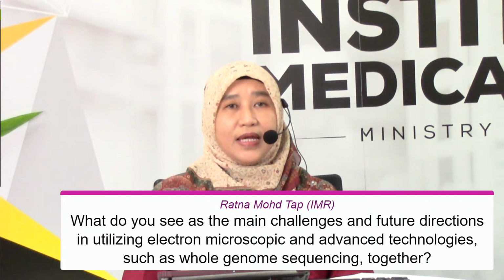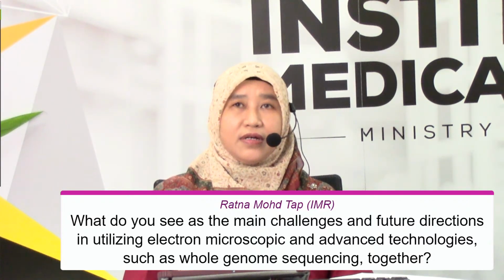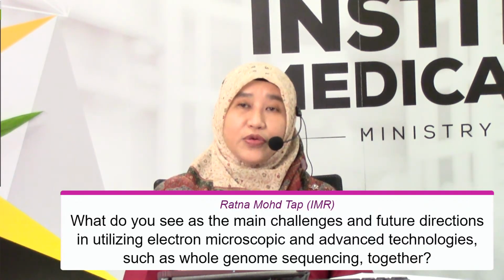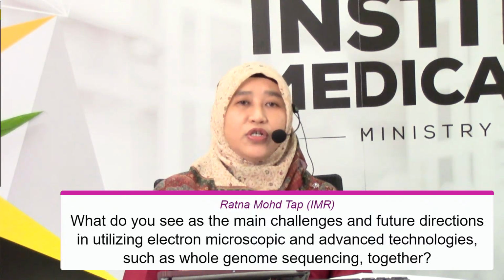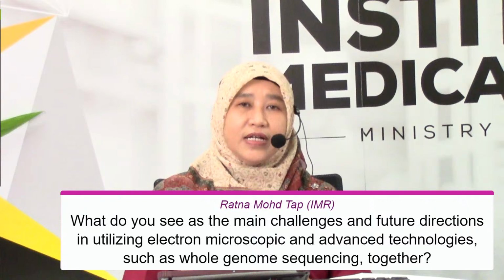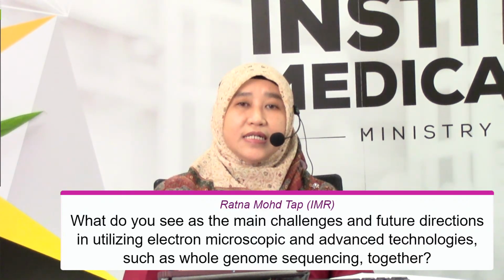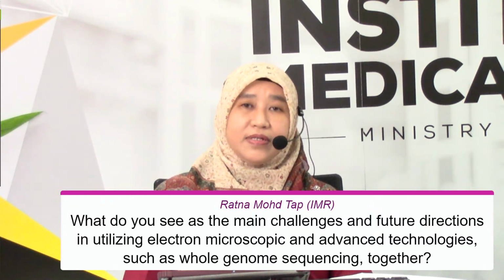In EM, there is a new advanced technology in the line, which is cryo-EM, where cryo-EM allows us to visualize and image frozen samples, the frozen proteins in the sample itself.